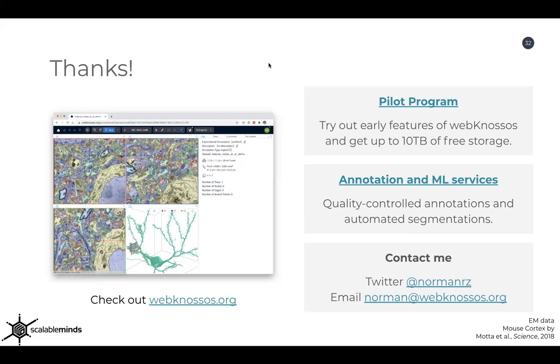Yeah, so absolutely. So we use webKnossos for all of the deep learning projects that we do internally, obviously, and it helps you at multiple stages of that development process, right? So it can help you to get that training data. Again, we can split up the work and collect it back through the task system. So that's something that's very helpful.